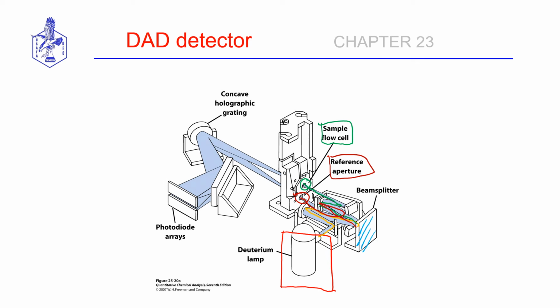Okay, and then the two beams are going to be recombined so that I get light coming in here, recombined, focused on eventually my diffraction grating here.